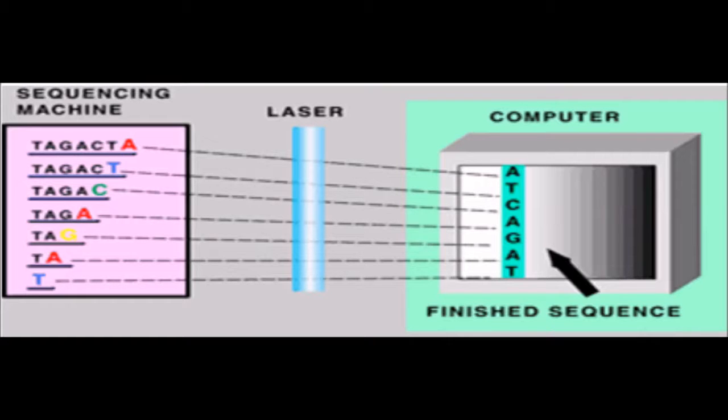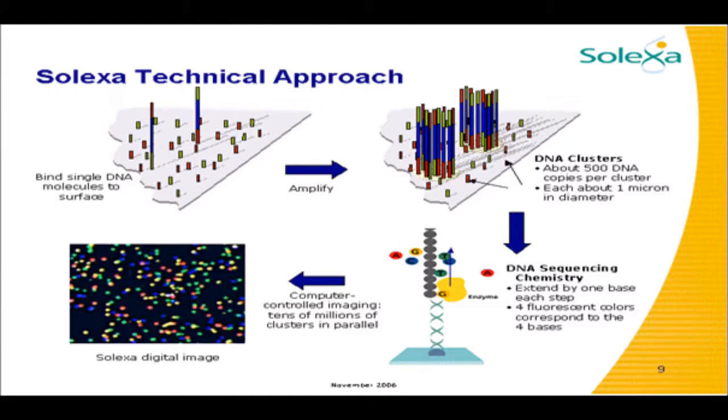This is a laser-based method that allows rapid DNA sequencing of fragments at a rate of 100 to 1000 bases per second. It is based upon the detection of individual fluorescent nucleotides. This method is based upon the sequencing through synthesis chemistry. Each DNA base is labeled with a different color of fluorescent dye.